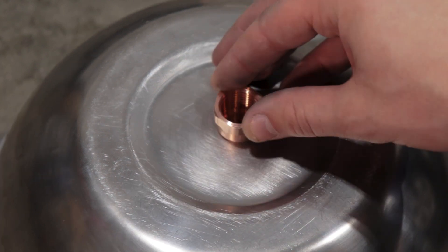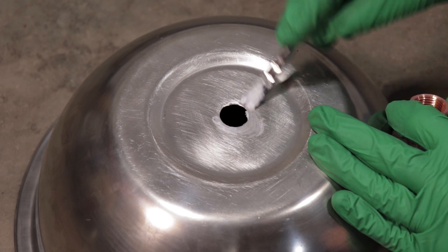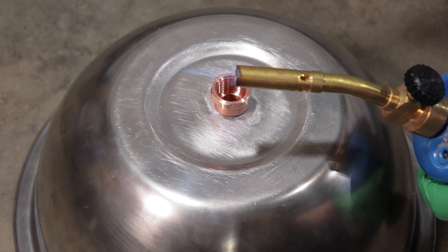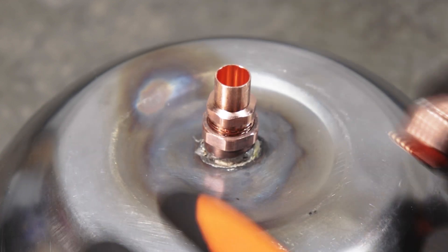While the copper fitting fits decently on its own, I'm going to add a little bit of solder around it just to help seal the edges and hold it in place. Something to note is that regular plumbing solder meant for copper-to-copper connections doesn't seem to do so well for copper to stainless steel. Nonetheless, I was able to get a little bit of solder on there, and with that I threaded on my male connector.